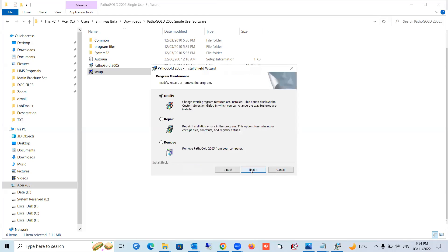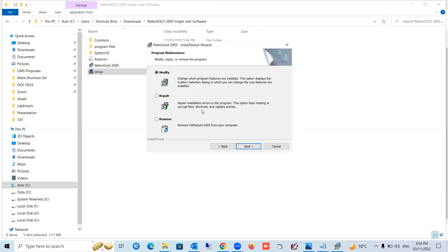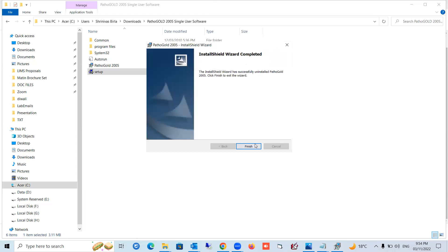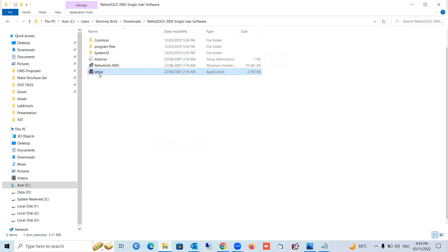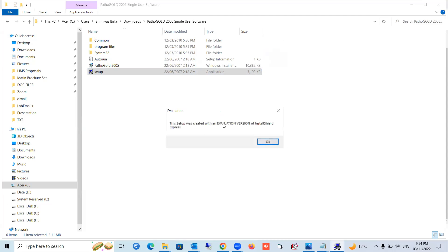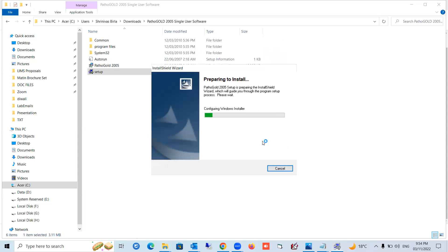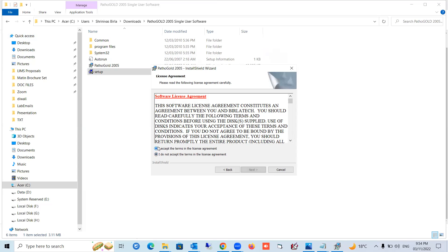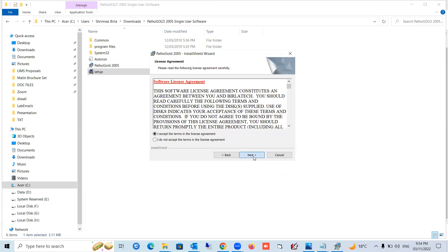Press the Next button. If the application is already installed, you can remove it and then reinstall it. I'll remove it first and then install again so you understand the process. Run as administrator, press Yes, click Next, and then press 'I Accept' for the license agreement. Press Next.